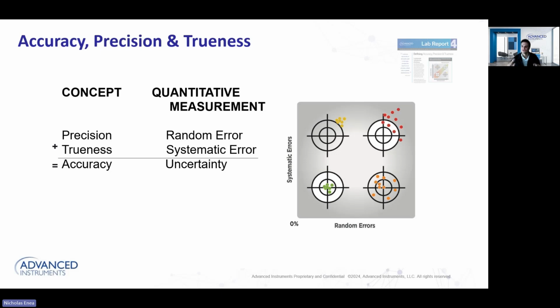And these things, unfortunately, always change. There's some people in Europe that like to change these standards every couple of years and change the syntax and the wording of some of these things. So we try to give you the most accurate and the most recent version of these terms. They'll continue to change. But if you get back down to accuracy and precision, or inaccuracy and imprecision, that's normally the root of these concepts in general. So I'm going to stop there real quick.